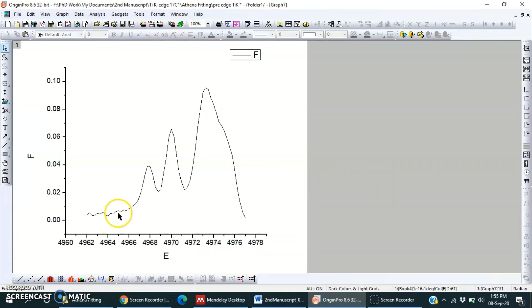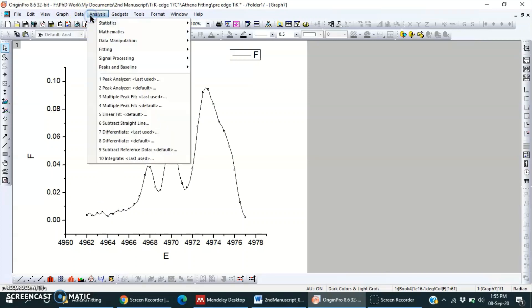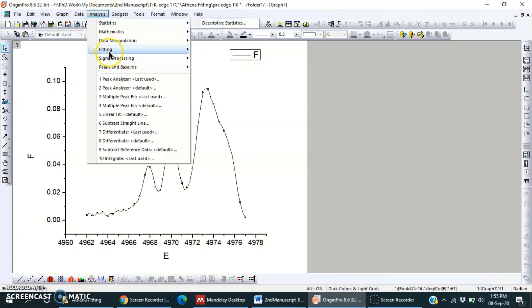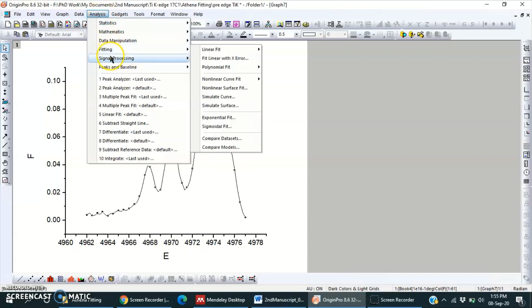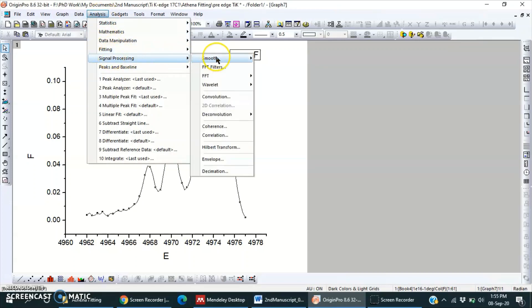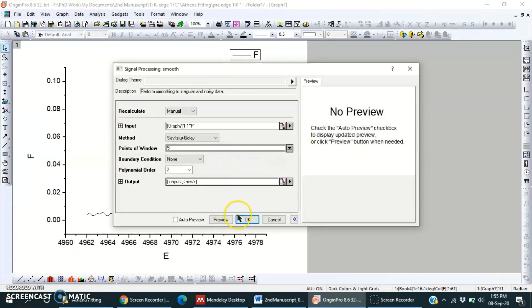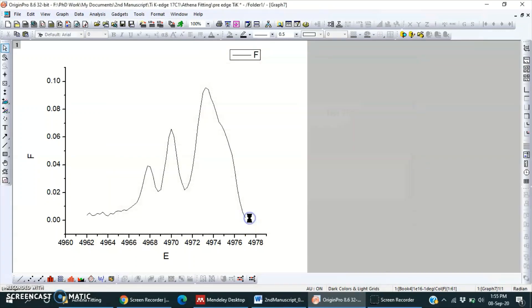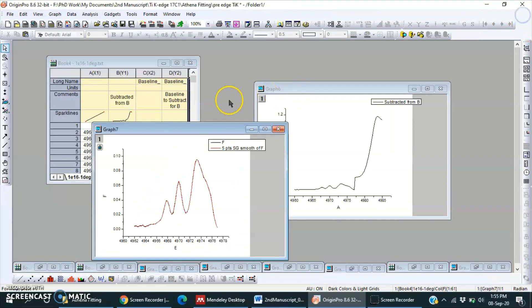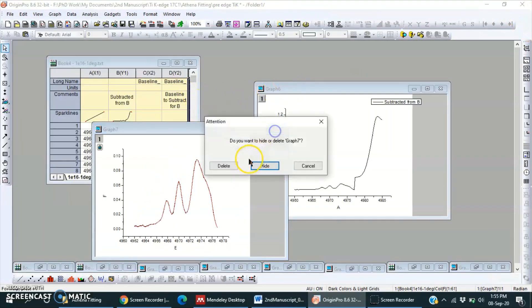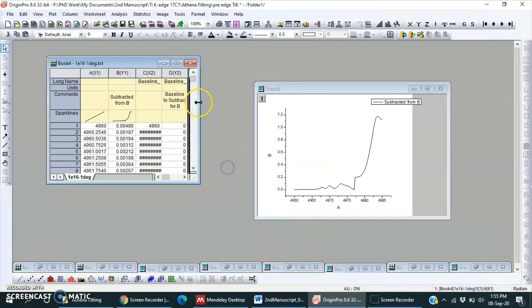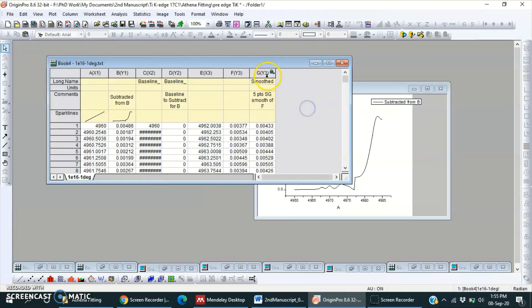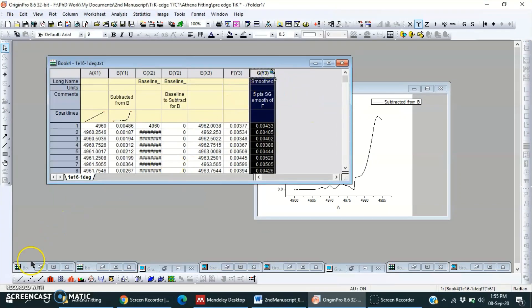So this is somehow not looking good. What we can do? Smooth this one. Okay yes, then now we will use the smooth one, this one.